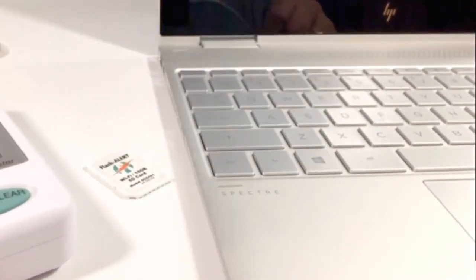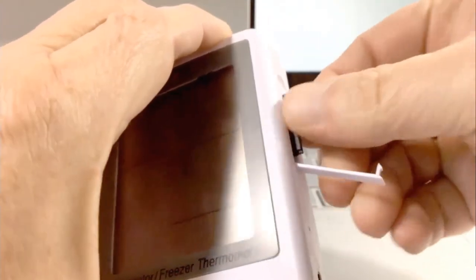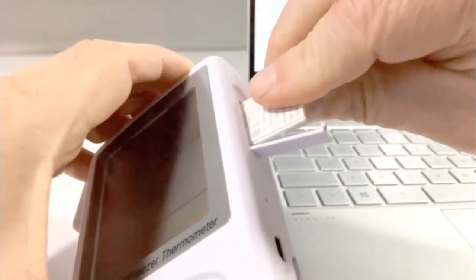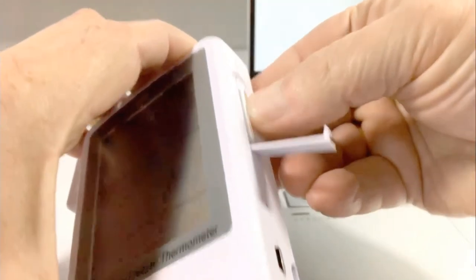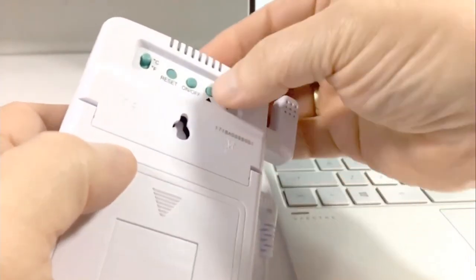Go to your data logger, make sure it's turned off, remove the standard SD card from the logger, and replace it with the Flash Alert card. Power the logger back on.